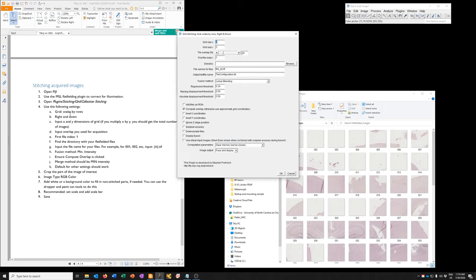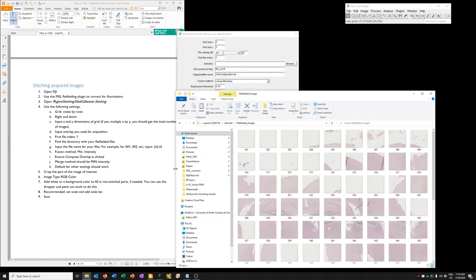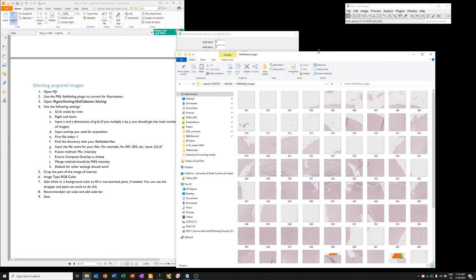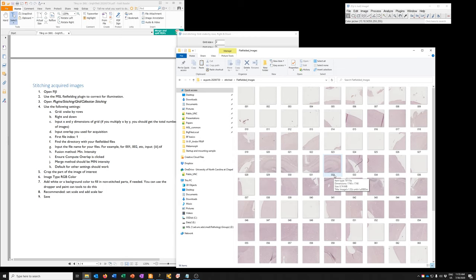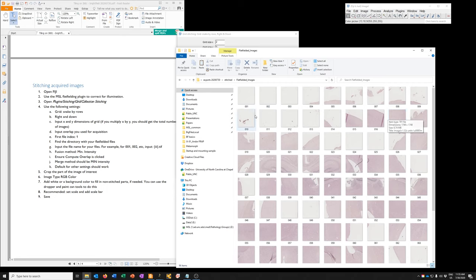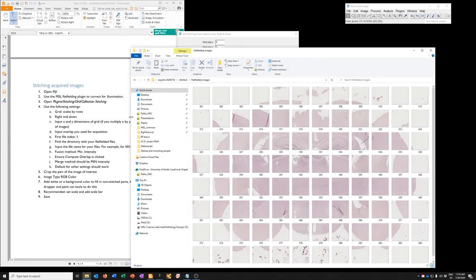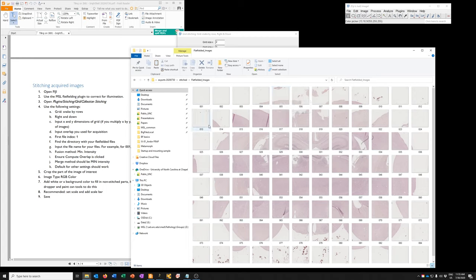Grid size. Input X and Y dimensions of the grid. So here's where it becomes important to determine what those were. And if you recall, we thought that the Y dimension might be something like 7 or 8. And so what we need to do is look at the total number, which is 96. If we divide that by, let's say, 8, then that means that the number of columns was 12. So if we look at 12 here, that means that the microscope should have been acquiring this way. And then in 12, it should have switched down to 13 and then started acquiring that way.